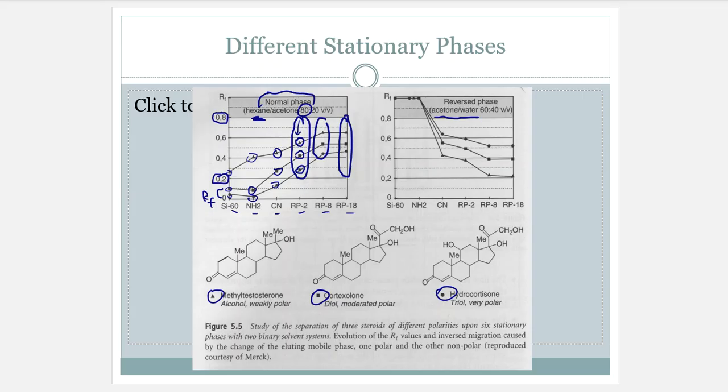All right, so same story, silica NH2, modified silica all the way across. No way on earth is that first round going to be accepted. All of these travel with the mobile phase. All of the RFs don't make any sense at all. Sorry. My NH2 groups. No, sorry. Bad. Not going to work. Try again. All right, so we go to nitrile, C triple bond N.